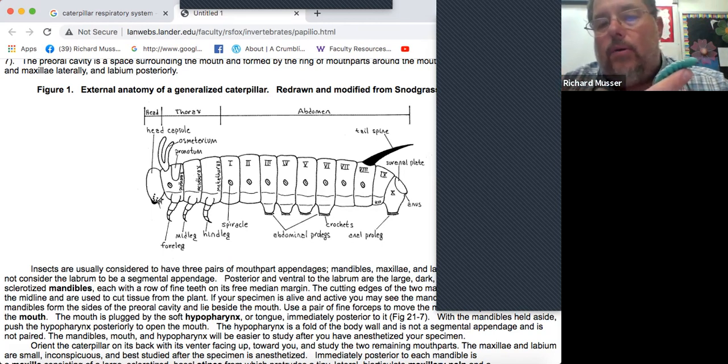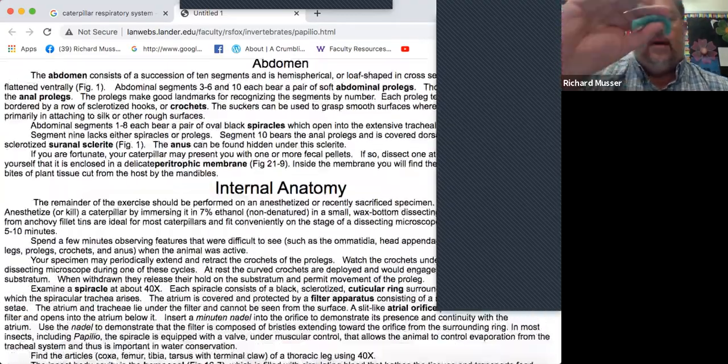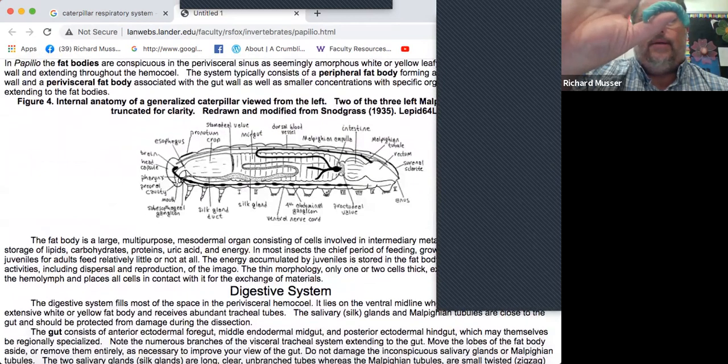The other thing I didn't mention located in the body is there's fat body, the white tissue that functions like the liver. So the Malpighian tubules function as kidneys and the fat body functions a bit like the liver. Those are the main things I wanted you to get from the anatomy of the caterpillar.